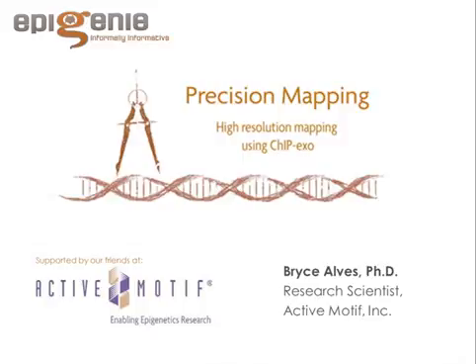Frank Pugh's lab has generated a large amount of their data on the SOLiD platform using their own adapters. We don't have those adapters right now in our kit. It's more the Illumina-based adapters. Okay. Would it be difficult for somebody to create adapters and tweak your kit to work on another platform?